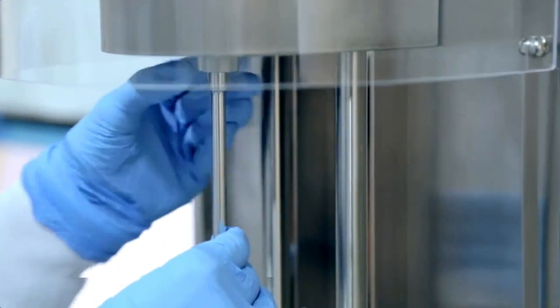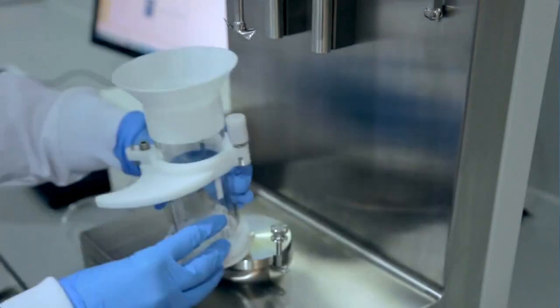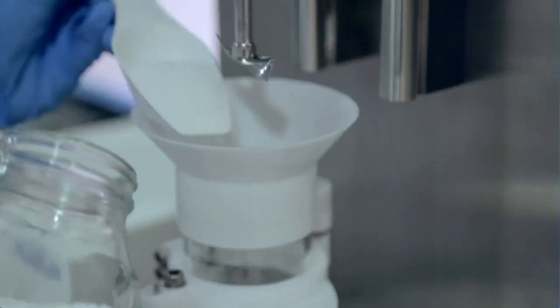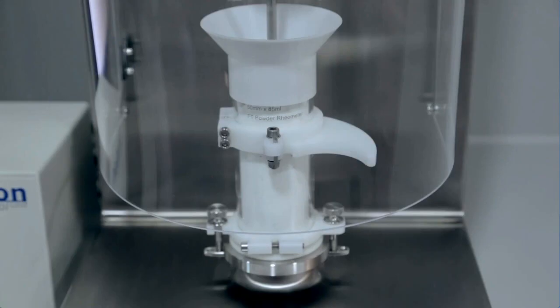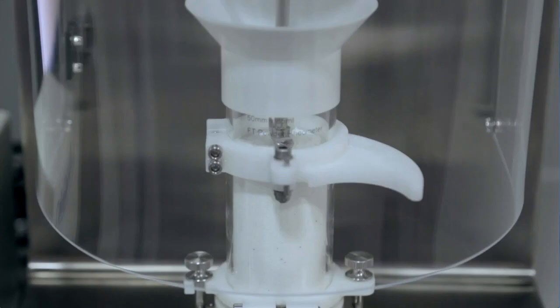It looks at the effect of external variables such as strain rate, the extent of aeration, the extent of consolidation. But it also has the ability to measure traditional shear properties, wall friction characteristics, permeability, compressibility and density. So a whole range of different material attributes, which is necessary if you are going to fully characterize your powdered materials. To understand how a powder behaves in process, it must be tested under conditions that simulate that process.